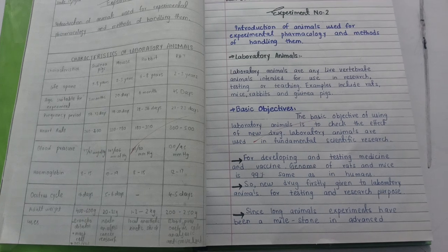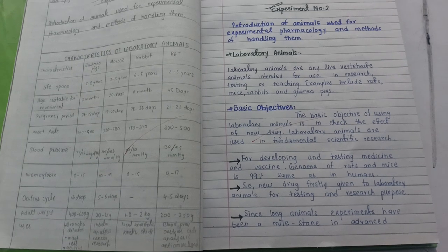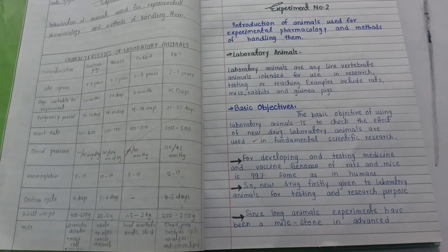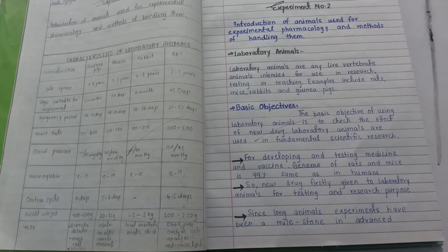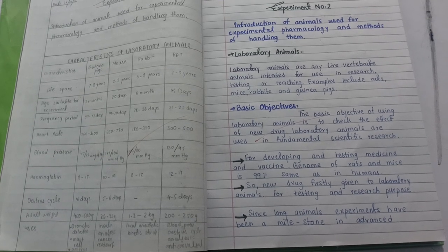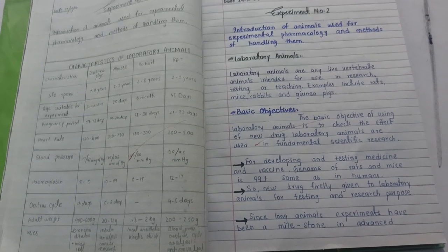So as you know, we have started the lectures of pharmacology and we are discussing a lot of experiments. So this is experiment number 2. In the previous lecture we discussed experiment number 1, which was about checking the susceptibility of antimicrobial drugs by using different antibiotics. Now the second experiment is about the introduction of animals and how to handle them, and we will discuss a lot of methods to handle them.